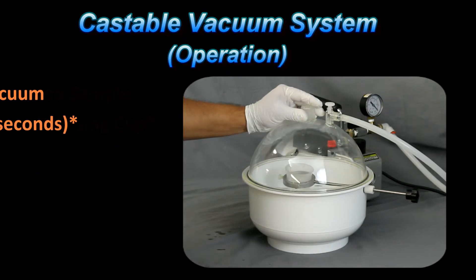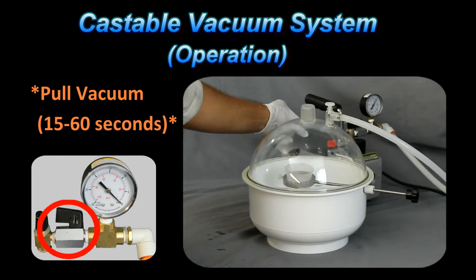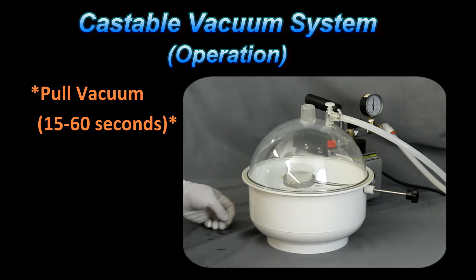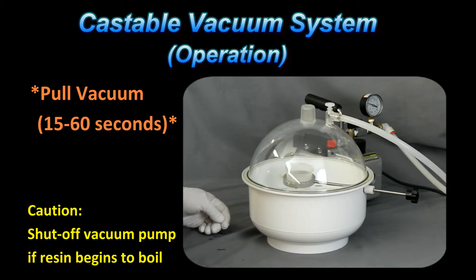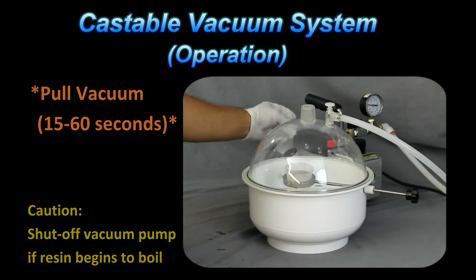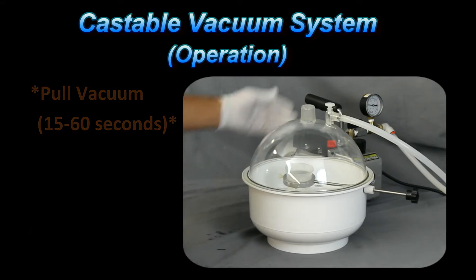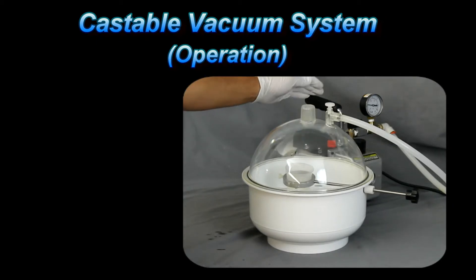Connect up the vacuum line, and before we turn on the pump, make sure the valve on the pump is open. Go ahead and turn on the vacuum. The idea is to pull the vacuum for about 15 to 30 seconds, perhaps even up to a minute. We want to evacuate the air from the specimen but we don't want to hold the vacuum so long that we start to pull the dissolved gases out of the resin mixture itself. We also want to avoid running the pump for too long, because the pump will start to heat up, vaporize the oil, and then we'll start getting oil leaking in the system.